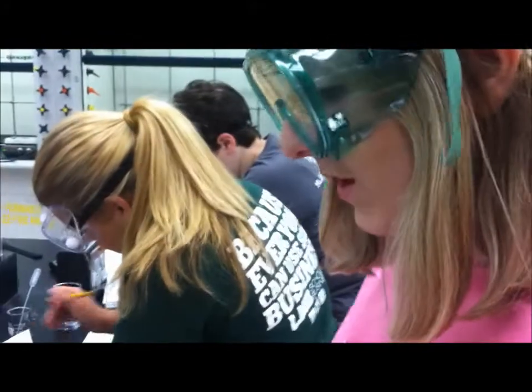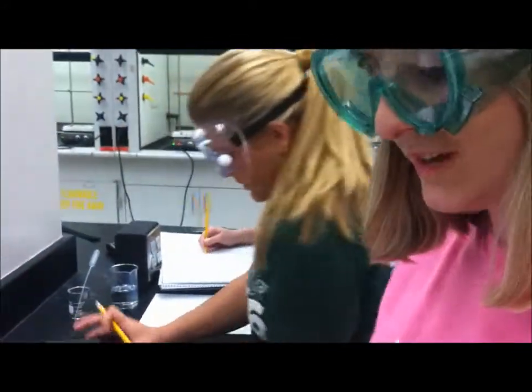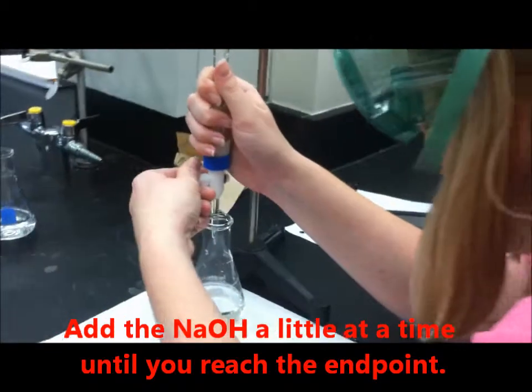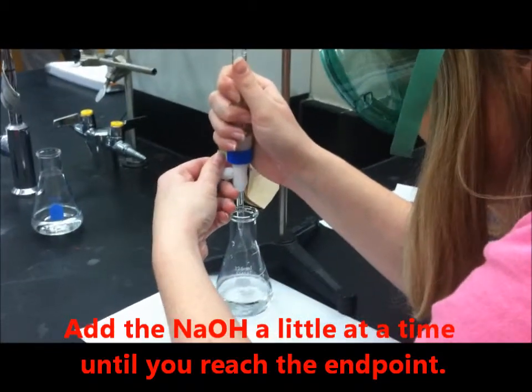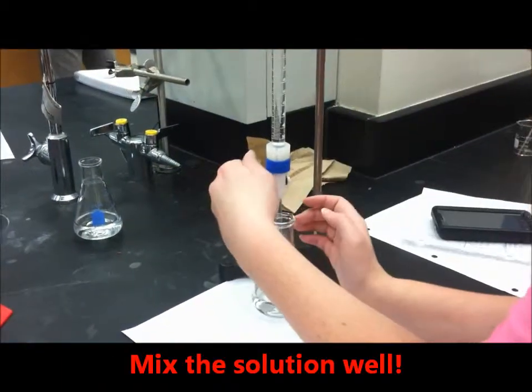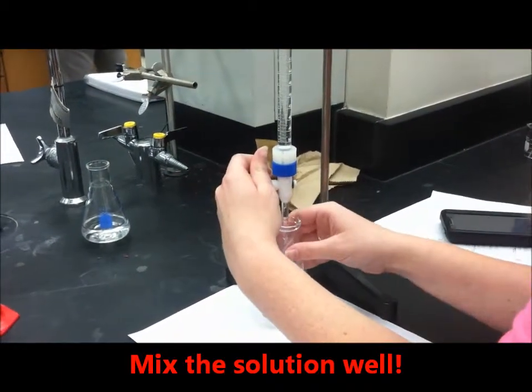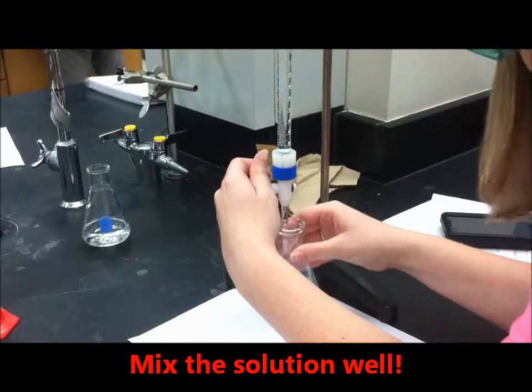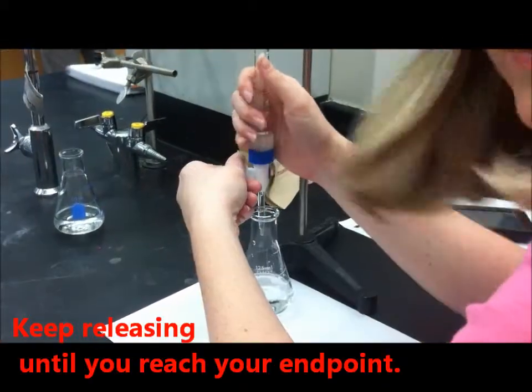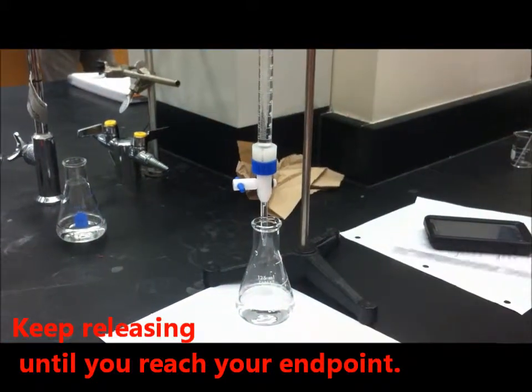And now we are going to start to perform the titration. All you're going to do is release a little into the solution. As you're releasing, you need to be swishing the solution around so that it mixes well. Keep releasing until you reach your end point.